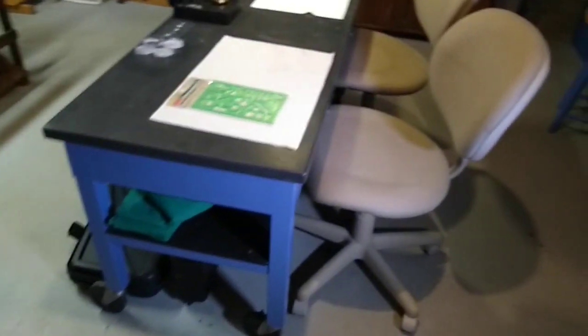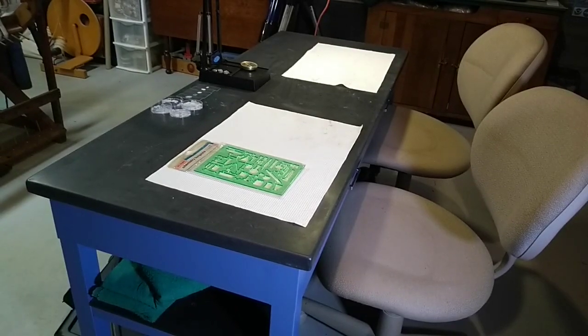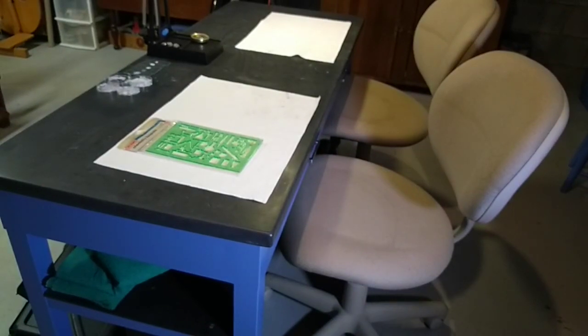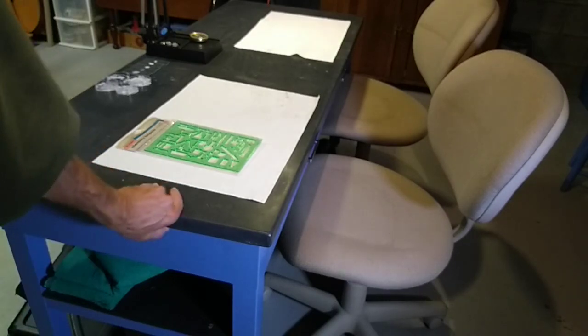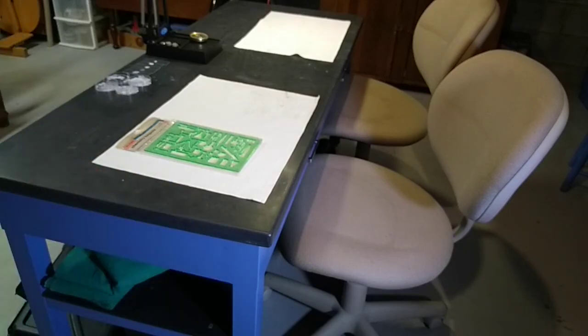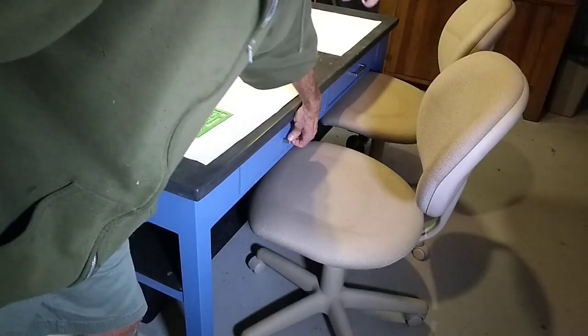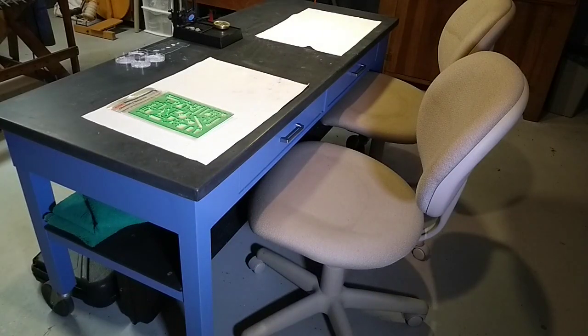Now the last big fixture item that I got for the lab is this, I call it my project table. It's basically something where I can sit and actually work on a project rather than standing up at the lab bench doing something. But it's an actual real lab table, and I got it at the same state surplus store that I got a lot of the other stuff from. But it's actually a honest-to-goodness phenolic resin top that's pretty much impervious to everything, chemicals and heat and whatnot. It's really nice. It's got some drawers on the front side. And actually, I don't know if you can see, I put a shelf down below to store stuff.